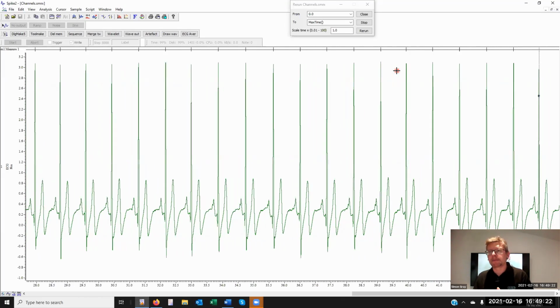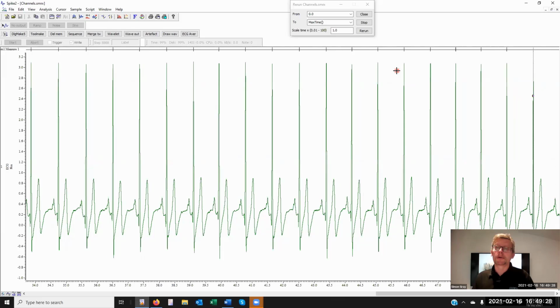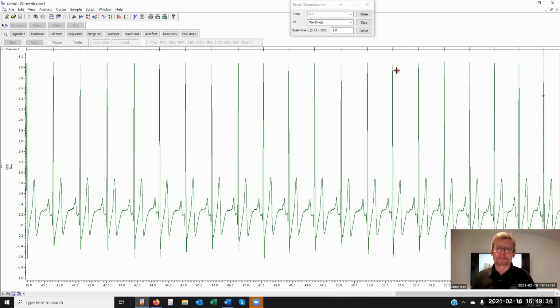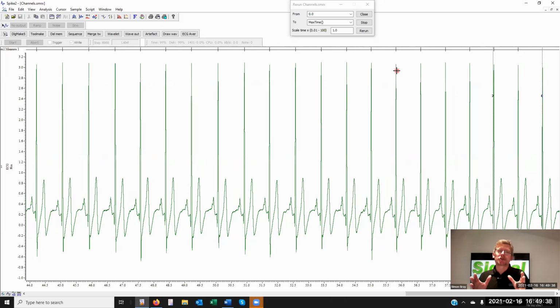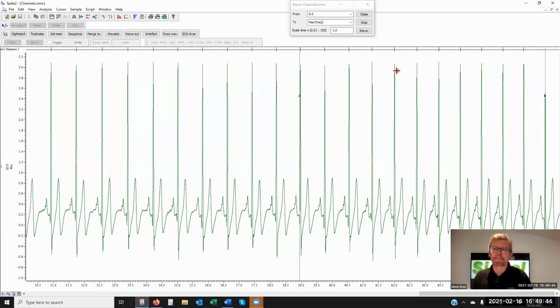It could, at the same time, send off a key. So we'd use the command sample key, and that could trigger one of those sections. So where we were using the graphical sequencer, we placed the icon, the wait for channel to be above, we would initiate that section of code with a keyboard character, okay, generally speaking.